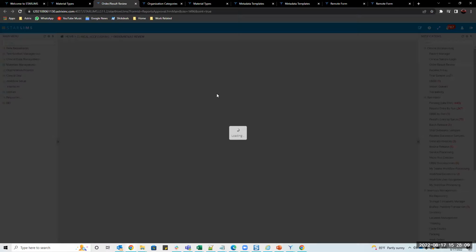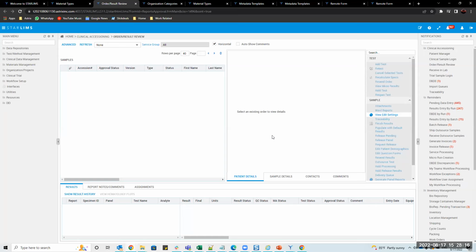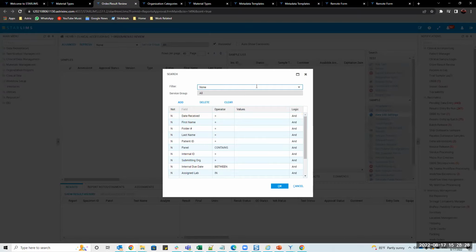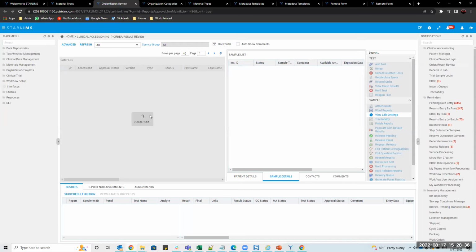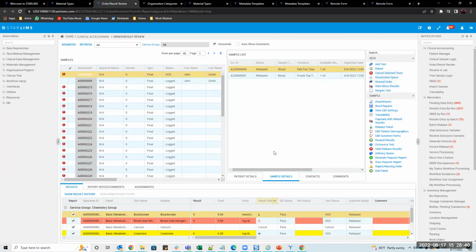So it gives it a sense of performance and speed that wasn't there before with the old. For example, here there's a complex app, right? I have a data grid, panels, and then controls. If I click Advanced, there's the loading, so that's a please wait. Then I hit OK. You see the cursor is back, and I'm getting this please wait, and now I see some data, and then I'm getting a please wait over here.